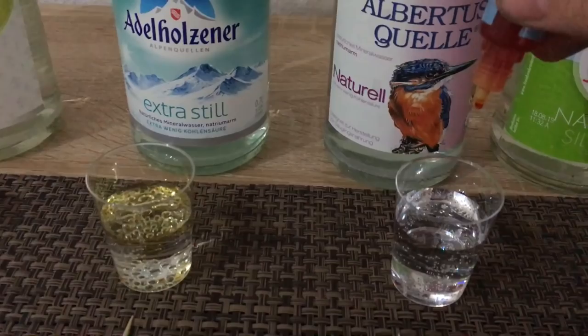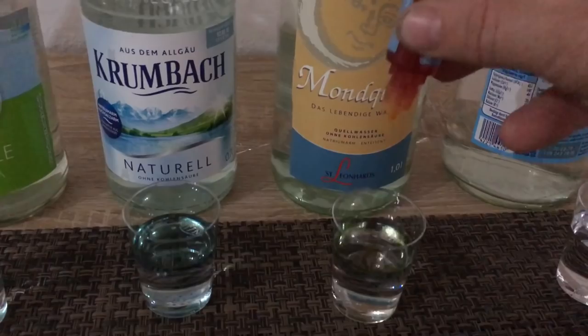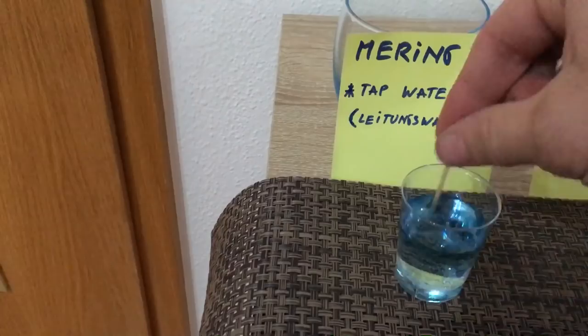I will be mixing these up. And for the record, the Monquelle — that is pretty damn expensive, it is the most expensive water here. So let's go back and mix this up a little bit.